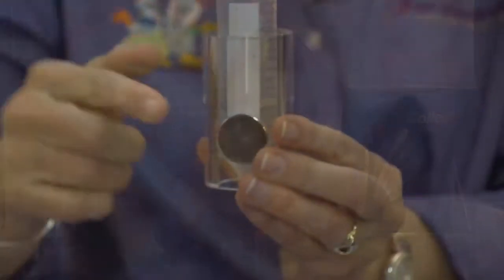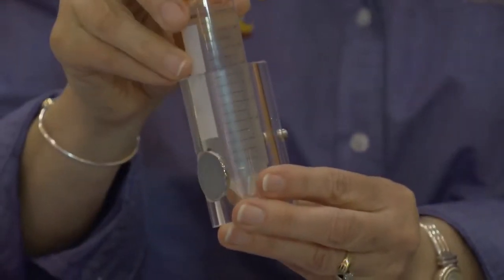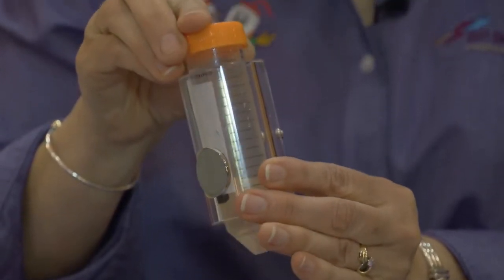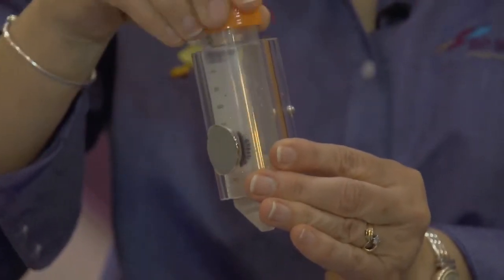Each sleeve has a magnet embedded on one side, and the other side has a spring plunger. This spring plunger holds your tube firmly in place. At the same time, I can slide my tube up and down in the sleeve. This means that my beads will collect on the magnet at whatever my desired height is on the tube wall. Mixing is also easy in the sleeve — simply by turning the tube, I'll achieve mixing of my samples.